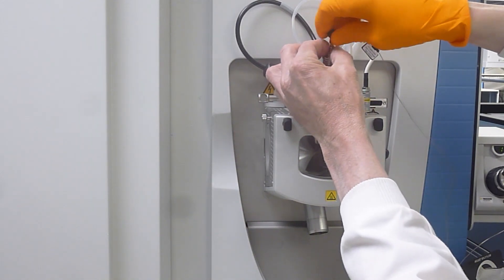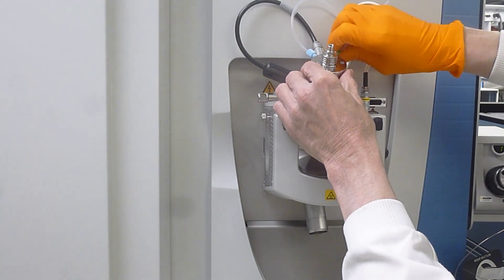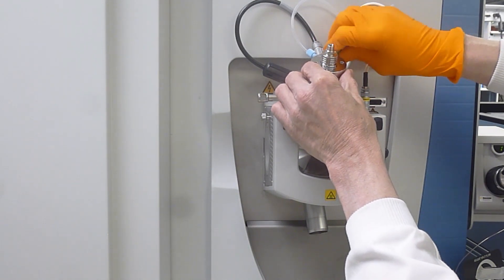Next you can remove the Viper fitting, detaching the HPLC from the QX Active. Then undo the two gas tubes, the green one and the blue one.